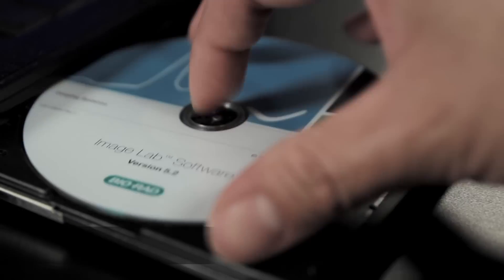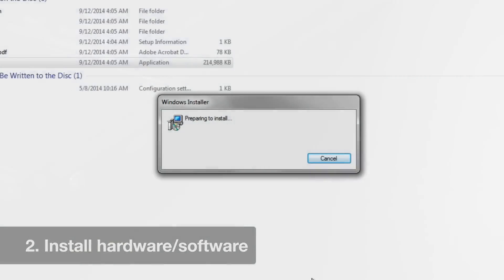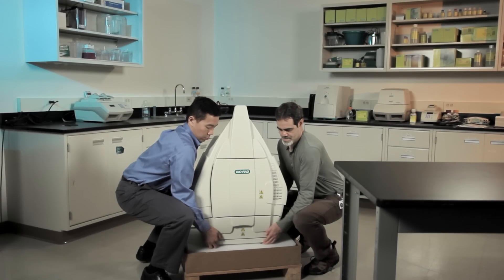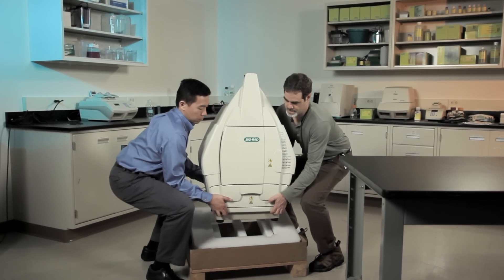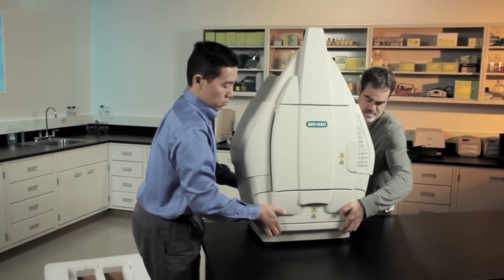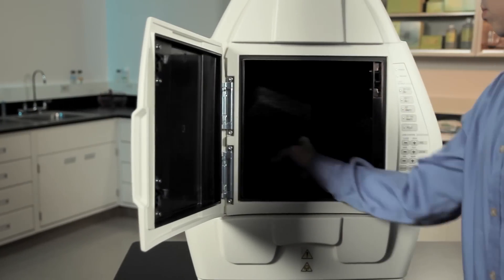Now insert the CD into the computer and follow the on-screen instructions to install ImageLab. With two people, lift the universal hood from the shipping crate and place it on the workbench. Remove the foam insert inside the hood.